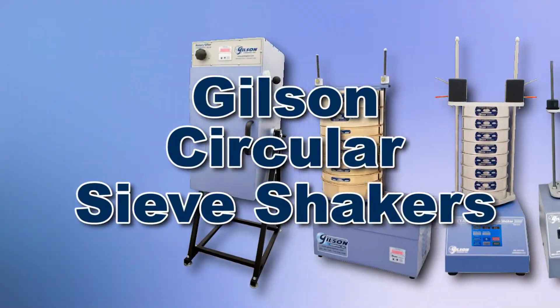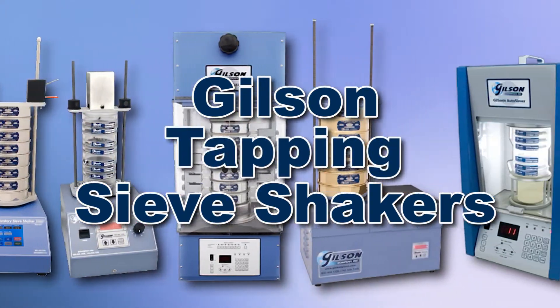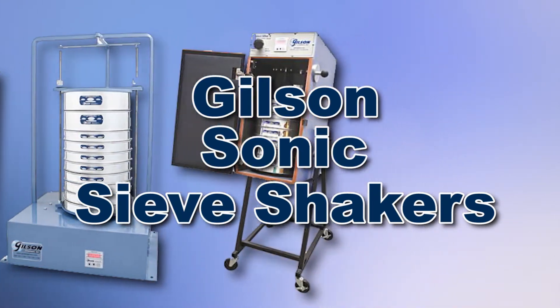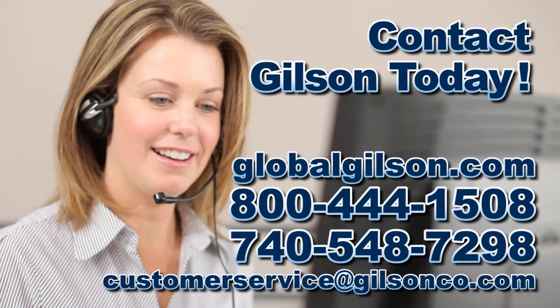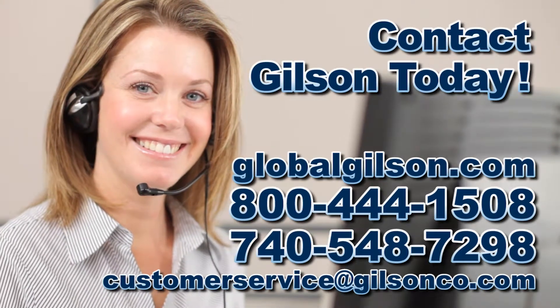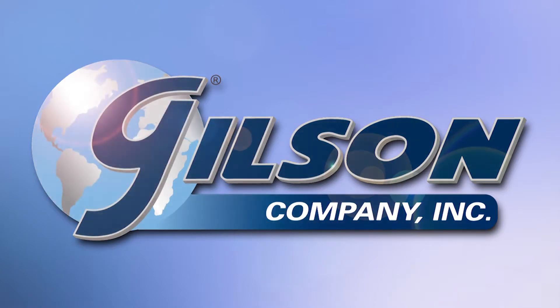With Gilson's complete family of sieve products offering a wide range of performance, features, and capacities, Gilson has the right equipment to fit your needs for accurate sieve analysis. Be sure to check out these and all our products listed in the Gilson catalog and on the Gilson website. Gilson: your industry leader in material testing equipment.